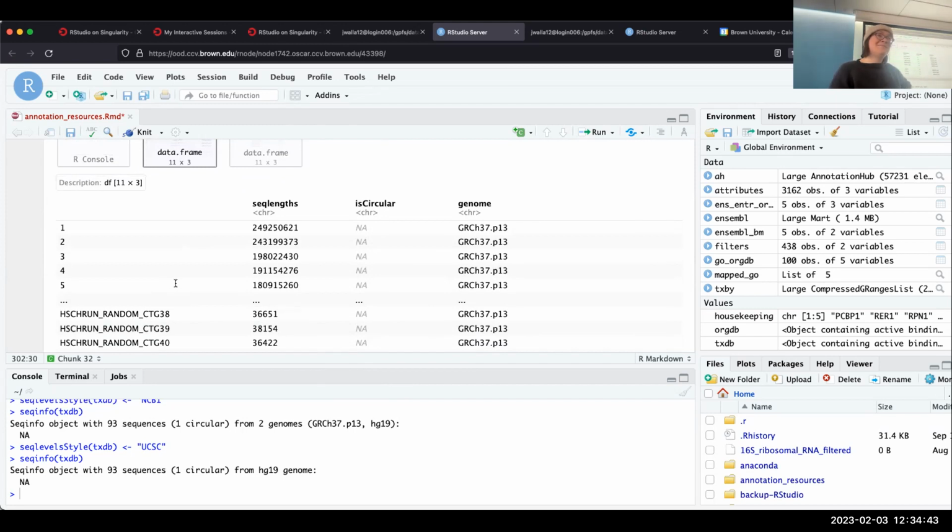Yes, Paul. Suppose I wanted to use AnnotationHub on Stronghold, for example. Do you know if they provide an offline mirror or something that we could host internally? I would be surprised if they didn't have some sort of standalone database option for at least some things, for sure.